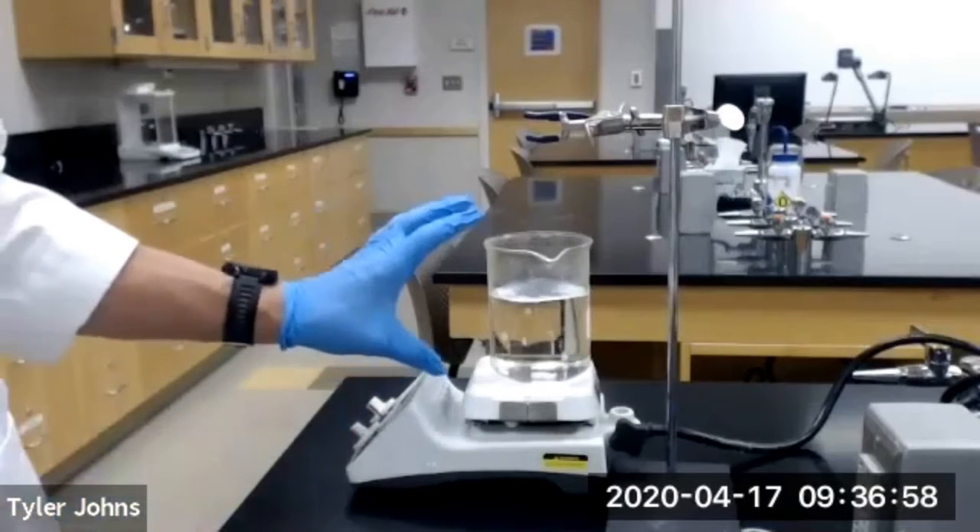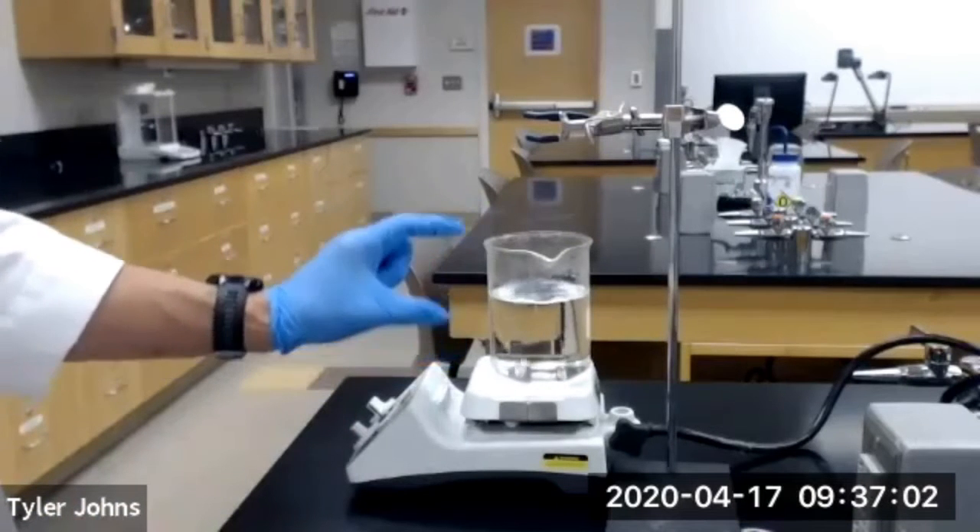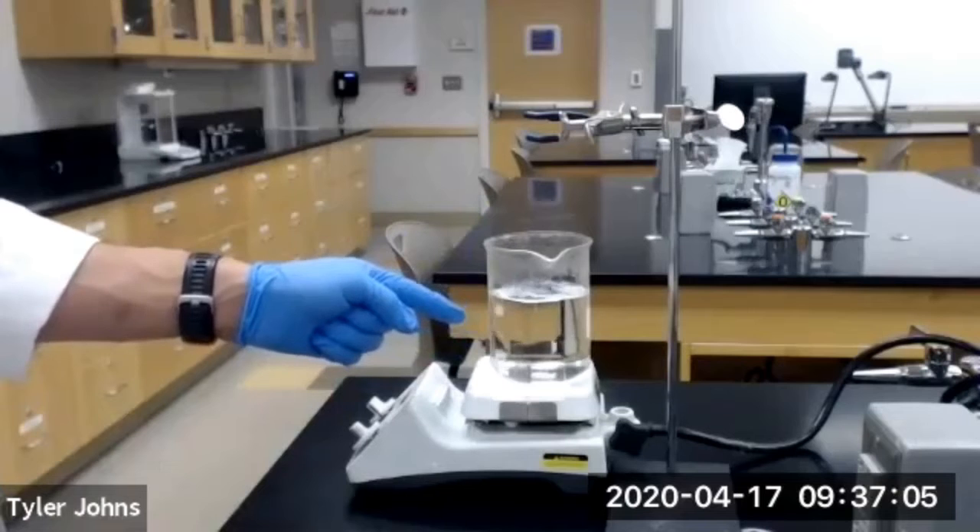The next thing we're going to do is take a 600 mL beaker, fill it with deionized water, and then bring it to boiling on a hot plate. And as you can see, we already have done that.